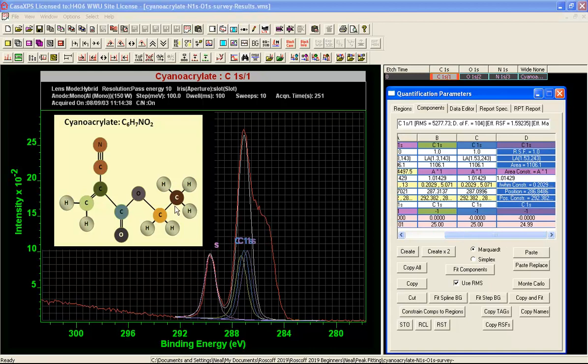And then we've got a peak here which is a carbon bonded to carbon and three hydrogens. So this CH3 is probably towards the lower binding energy side. And then we have another structure over here with a carbon atom which equally may have a binding energy that is characteristic but to a lower binding energy than these peaks.